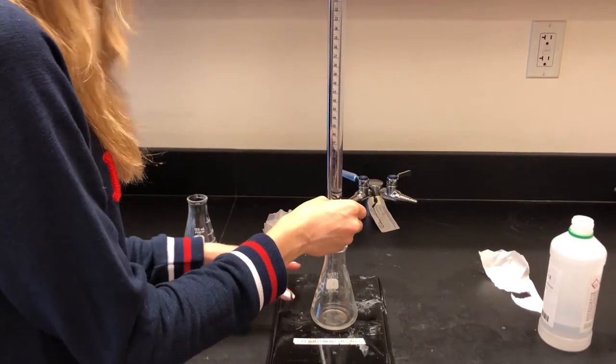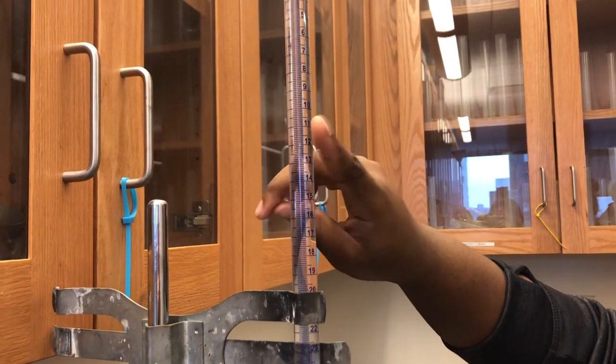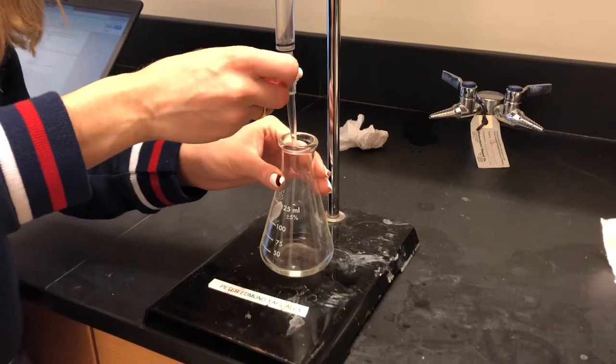If you pour too much, take another flask and turn the stopcock to let a little bit of the liquid come out. If there are air bubbles, tap the side of the burette until they're gone. Now it's time to do the titration.